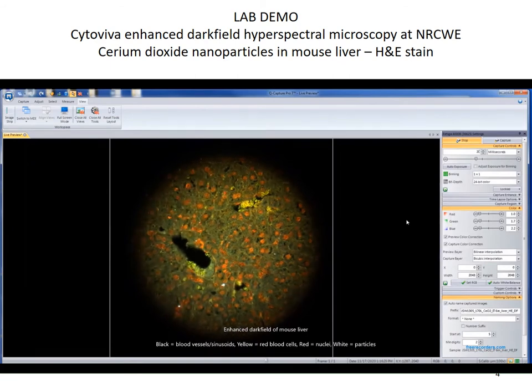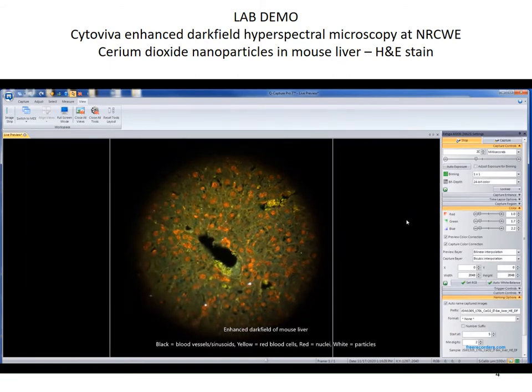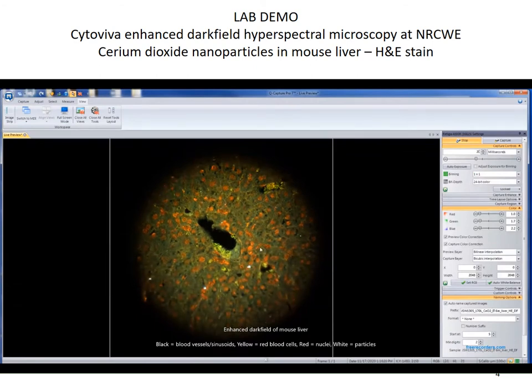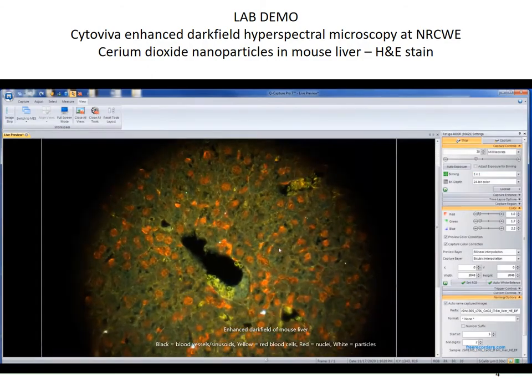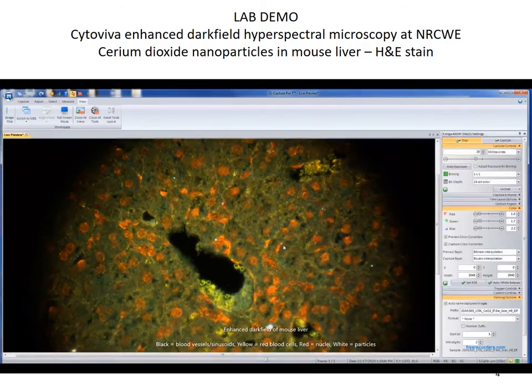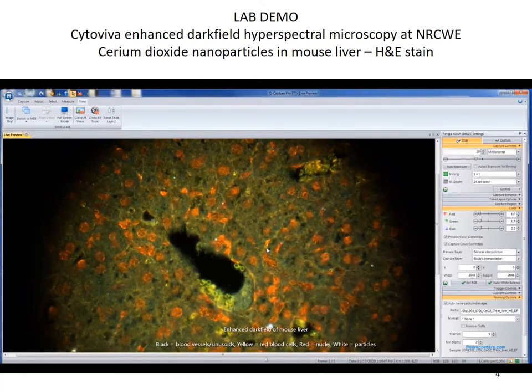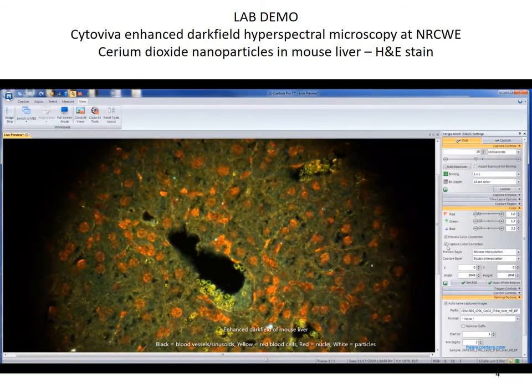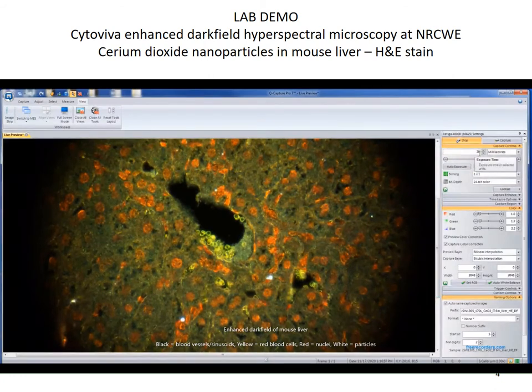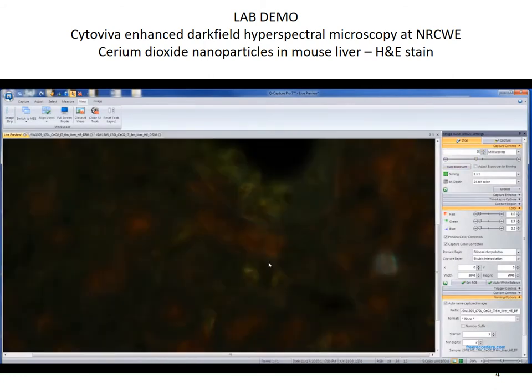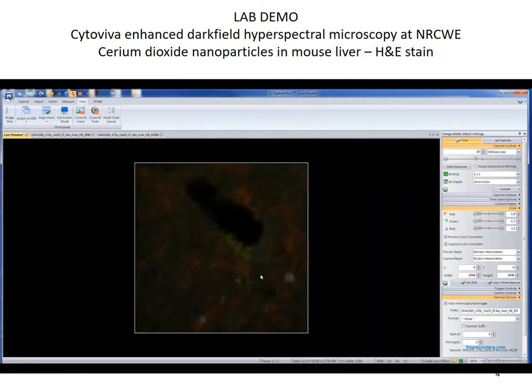What we're looking at here is a mouse liver. The black in the middle is a vein, and the small yellow circles are red blood cells. All the red circles around are the nuclei of the liver cells. To get a closer look at the objects that you found, you can change to the highest possible magnification on your setup — for us it's a 100x objective. Now you can see more clearly the donut shape of the red blood cells.